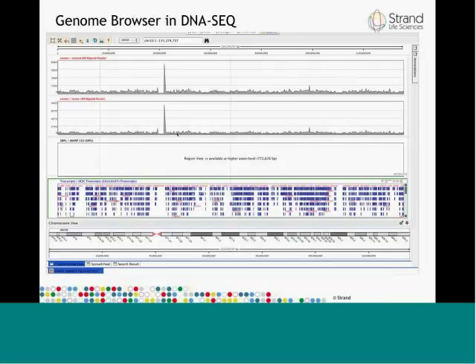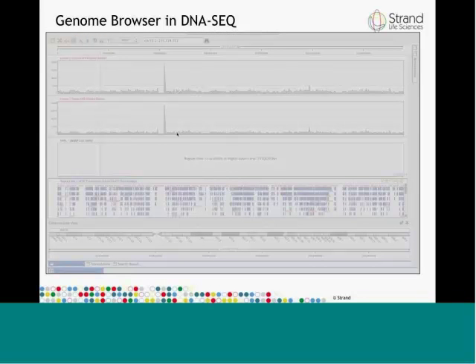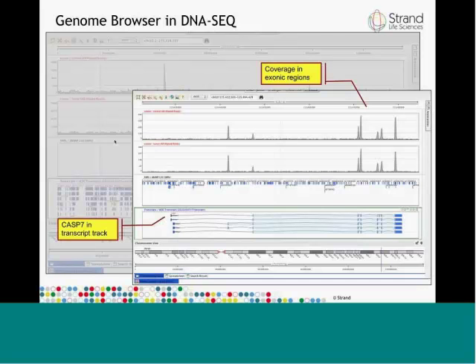Again, just like the RNA-seq experiment, at this stage, it's recommended that you spend some time looking at the coverages from the different chromosomes and try to spot any obvious abnormalities. For example, if I zoom into this particular gene, the CASP7 gene, one can easily check that the coverages from the 2 samples are extremely well aligned to the exonic regions of this transcript.